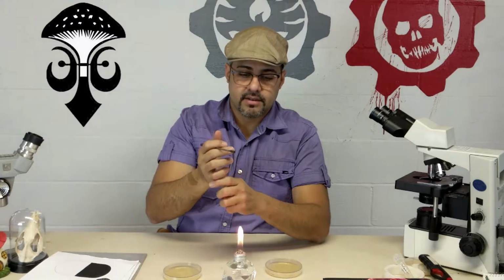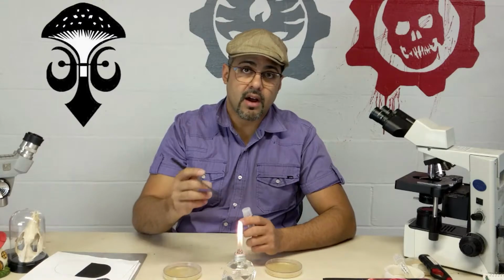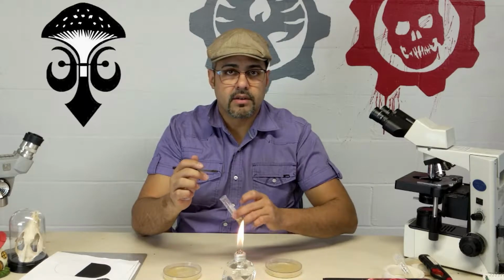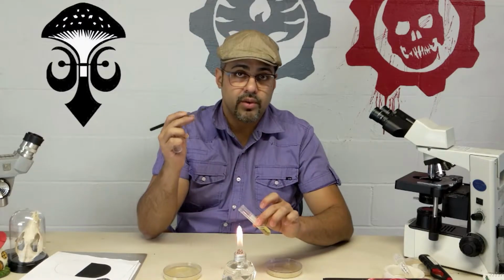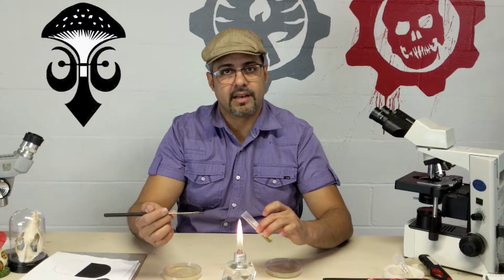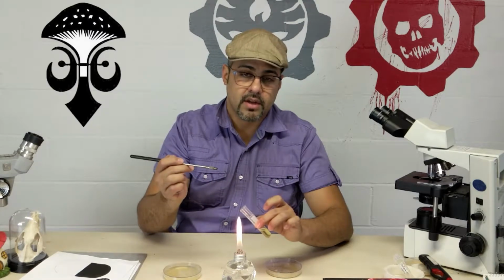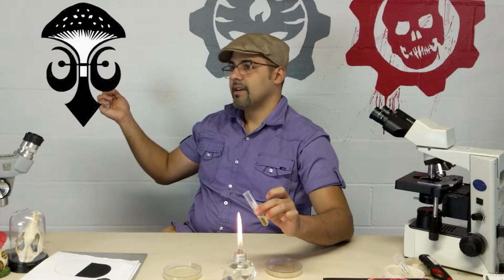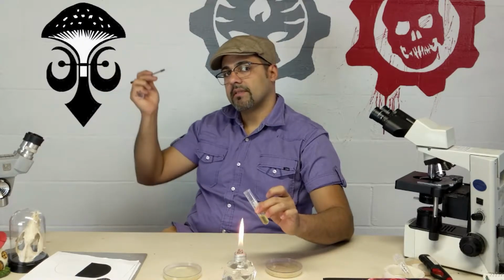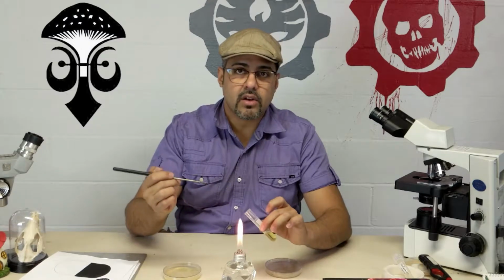So the way that you do it is close to your flame. Flame your loop. When it's red hot, with your pinky, remove the cap. With your other hand, flame it 2 or 3 times. Then with your inoculation loop, right, leave it close to the flame, not so close that you can get burned. Then you take your sample. After you take your sample, don't go like that. Why? Because now it's not sterile. It does have the bacteria, but you're contaminating with possible contaminants that we have here. So you always put it inside and leave it close to the flame.